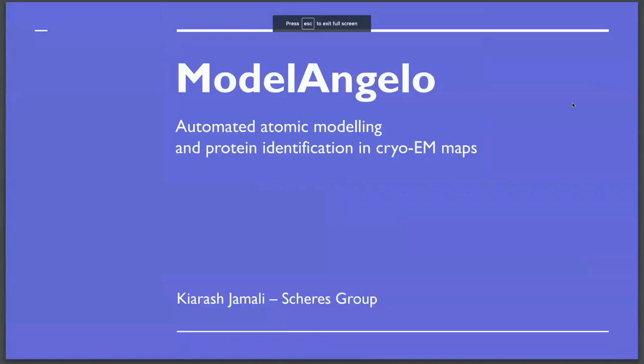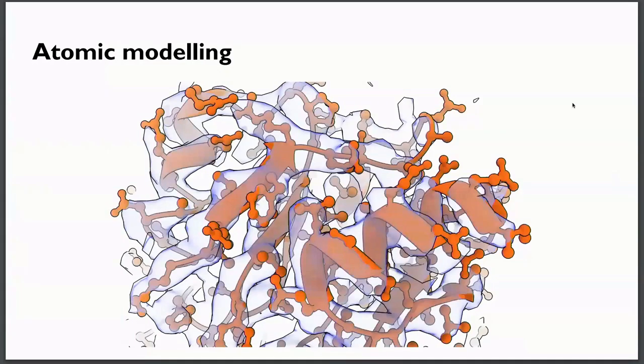So, hi everyone, I'm Kiarash Jamali, and I'm going to be talking on ModelAngelo, which is an automated atomic model building program for cryoEM, as well as protein identification. So, this is your cryoEM map, and you would like to build an atomic model.